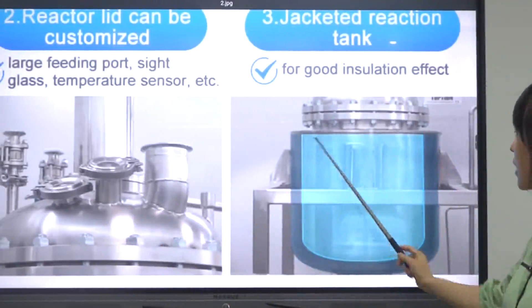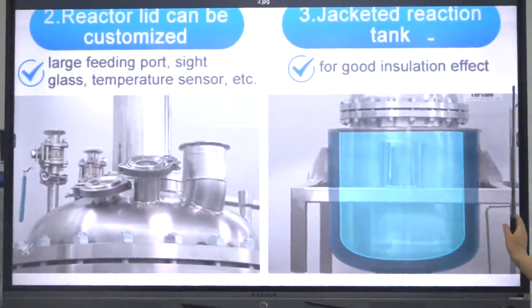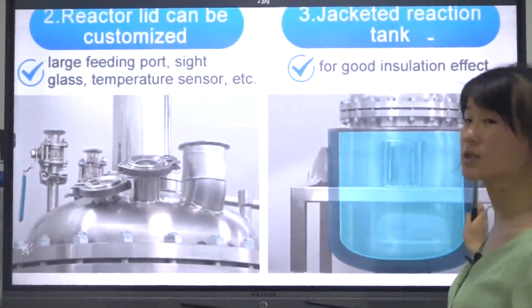The reaction tank has a good insulation effect because it is constructed with three layers.